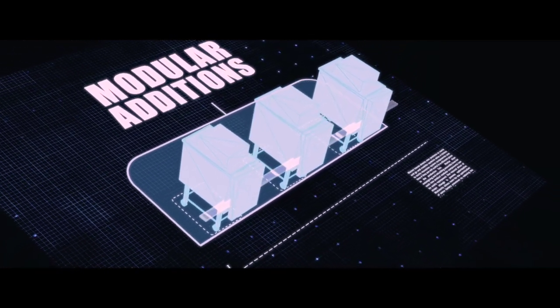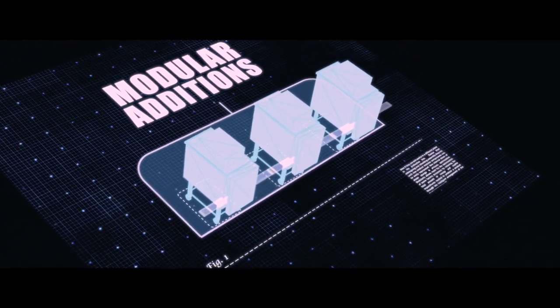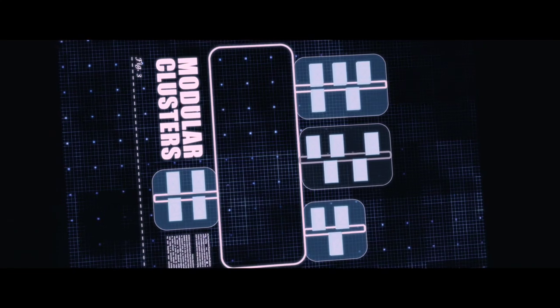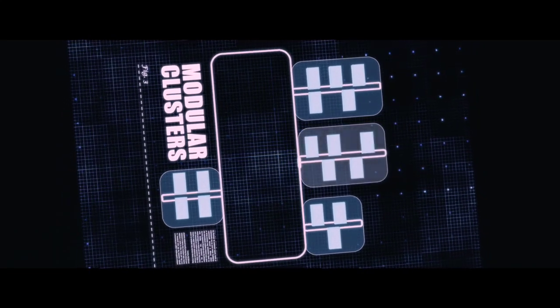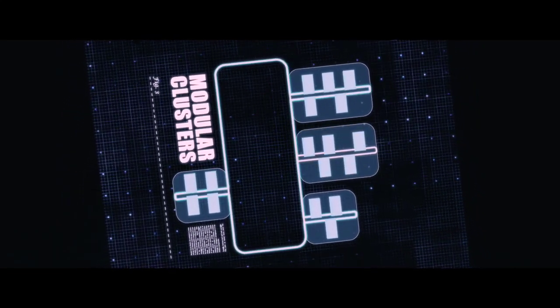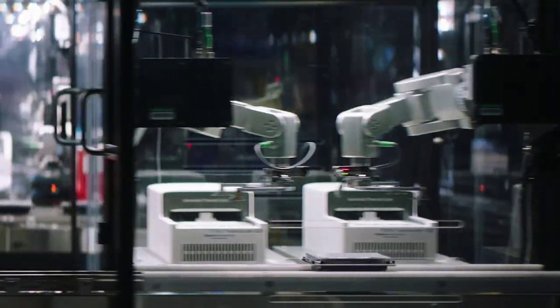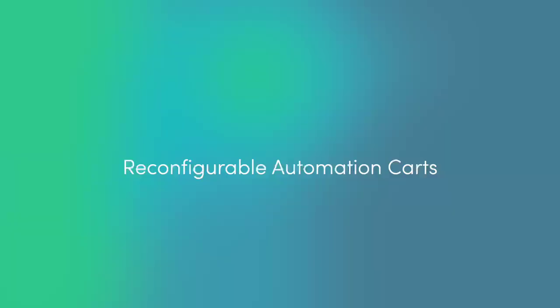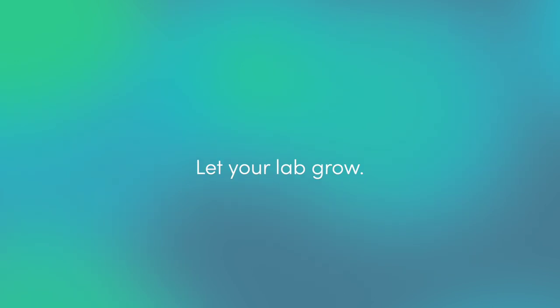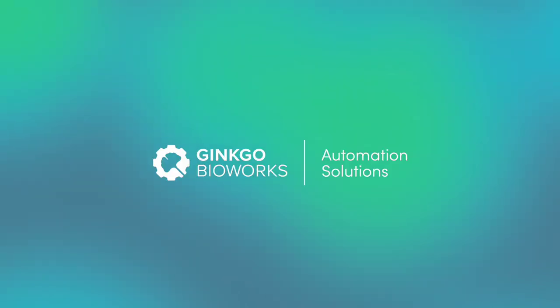Then reconfigure as your needs change. Reconfigurable automation carts and automation control software let your lab grow, only available at Ginkgo Bioworks.